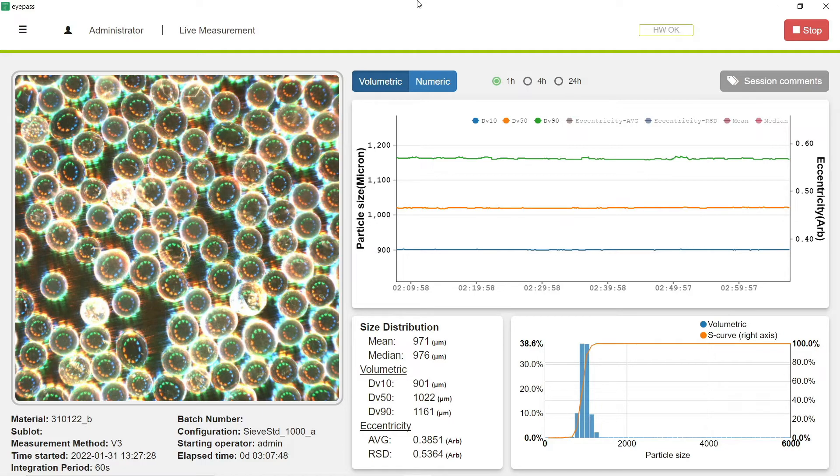But what's really great about this is because this material is highly reflective, transparent, and see-through—you can even see the LEDs reflected back to the camera—our machine learning algorithm is now able to overcome these difficulties which would have been too hard for our traditional image analysis to measure before.